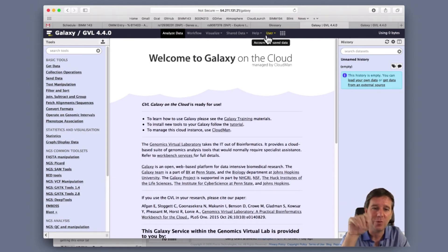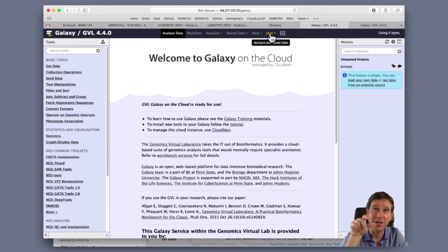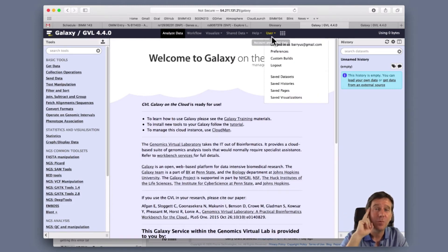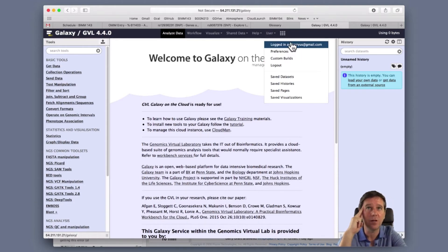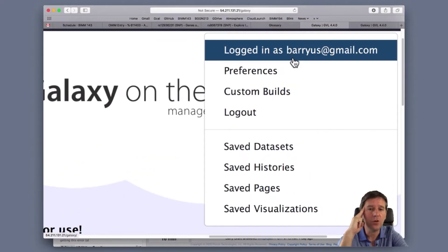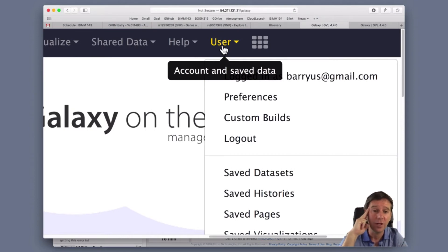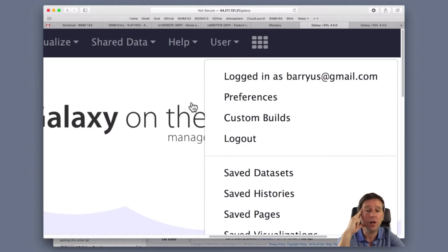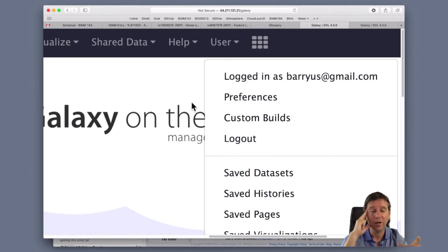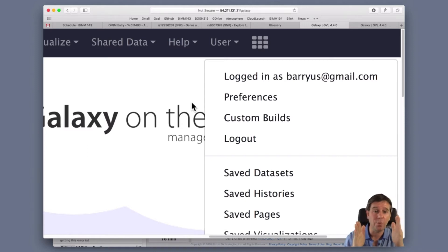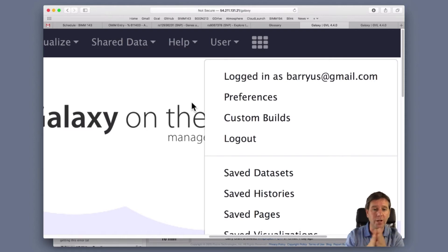There's a little glitch where whenever you register and click, you're not actually logged in - you have to click login. Please make sure it says 'logged in as' your name up here. Make sure you have that when you click the user button; if you don't, it means you haven't logged in. What this will allow us to do is save our work, and it'll also keep us separate in case anyone else works on the same server. It'll keep our work separate so we don't get confused.